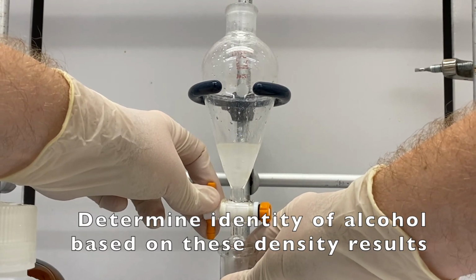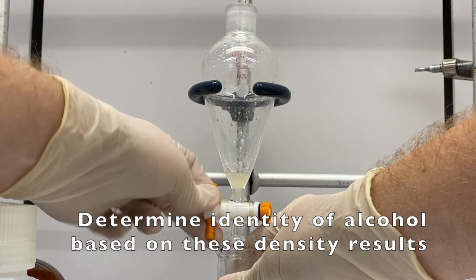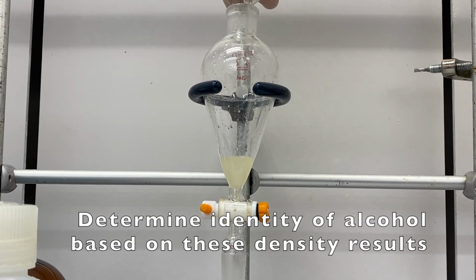So you might be asking how you can tell if it's the organic layer versus the aqueous layer. Well, you know that you put in a lot of water, right? And you didn't have a lot of organic stuff. So it makes sense that the layer that is the biggest is going to be your aqueous layer.